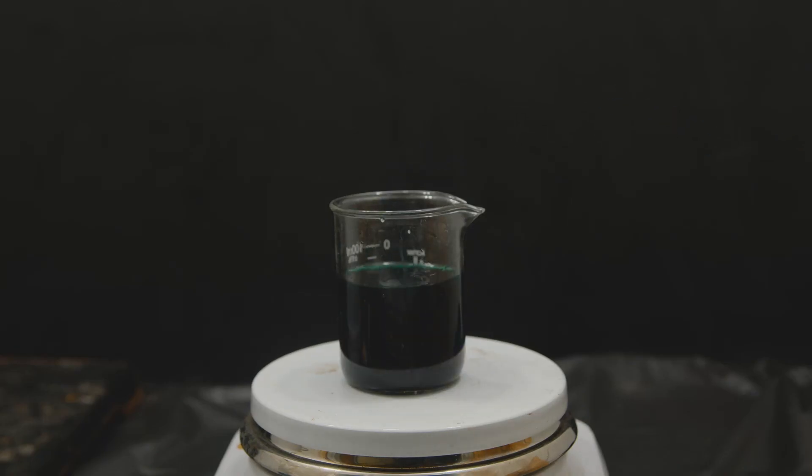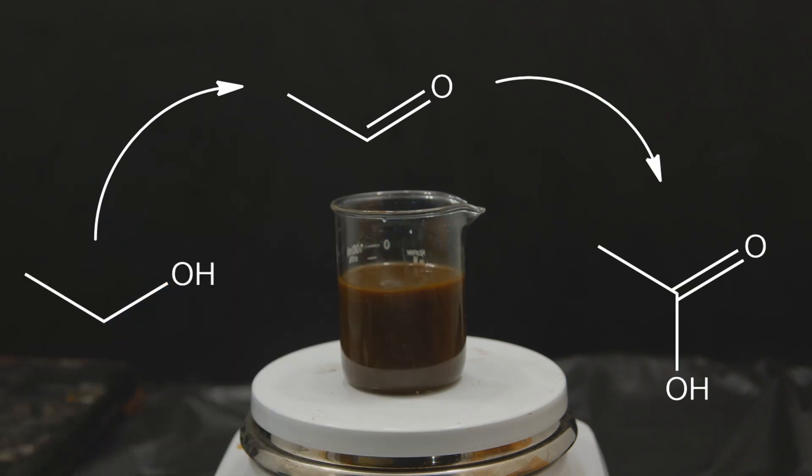Then with stirring we begin to add a stoichiometric amount of potassium permanganate. What's happening here is the potassium permanganate is oxidizing the alcohol to an aldehyde and then to a carboxylic acid which gives us vinegar.